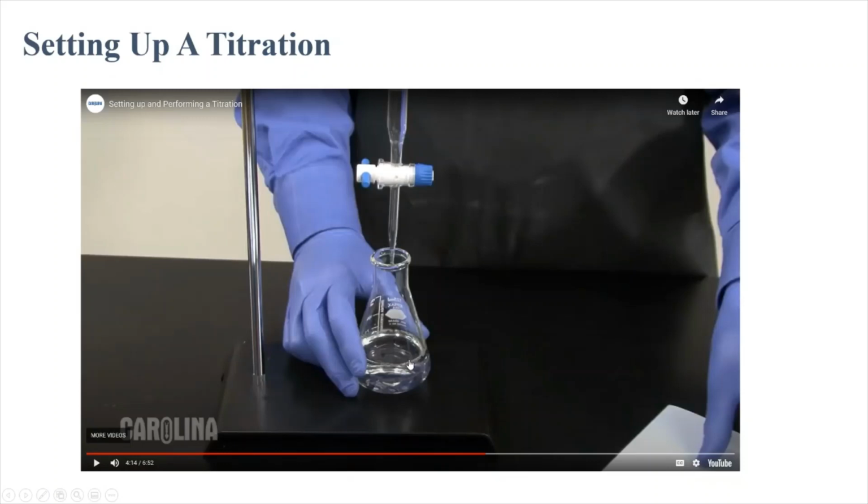Because you'd have to go so slow on the first one to figure it out that it would be a waste of time, and you can do this much more efficiently. So what they do is they say, this first one, I'm just going to do it quick, just to get an idea of how much of the liquid I need to add from the burette. And that's what they do.